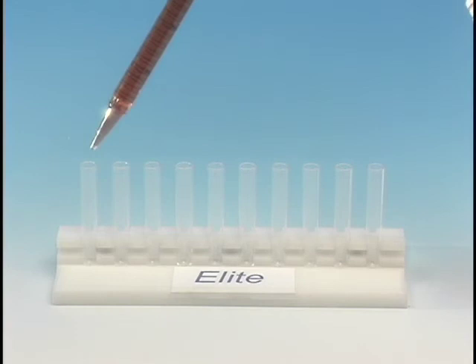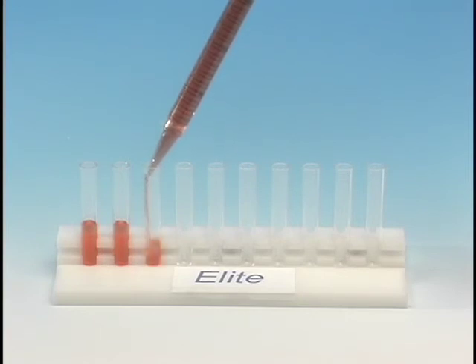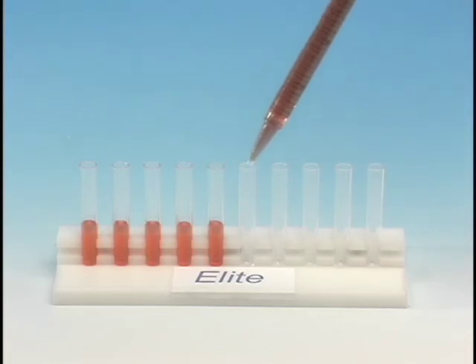Fill the pipette and begin dispensing. When the volume in the pipette is low, the Elite will provide an audible signal to refill or empty the pipette. This feature will help avoid pipetting an inaccurate aliquot.